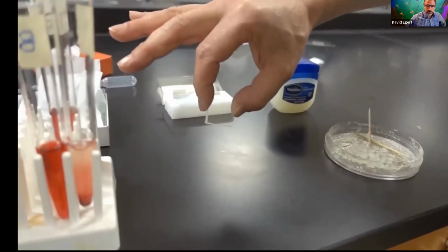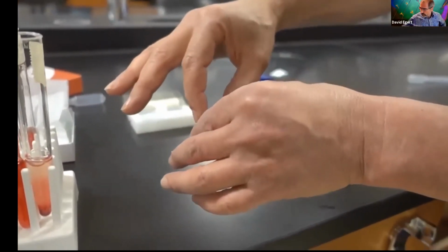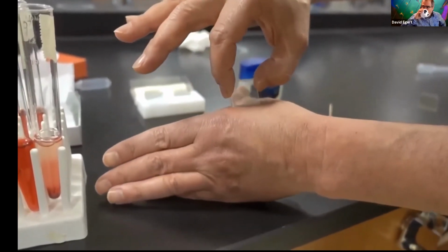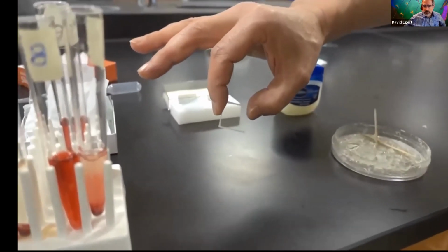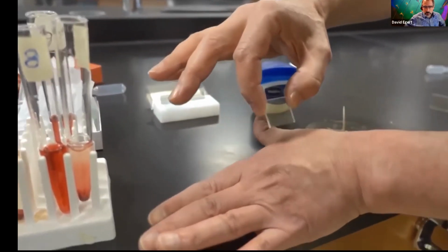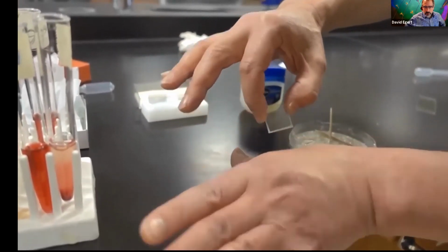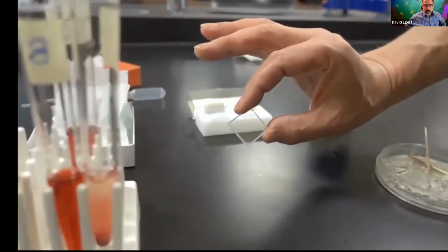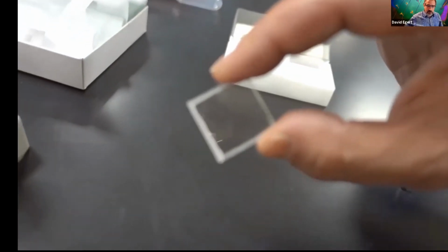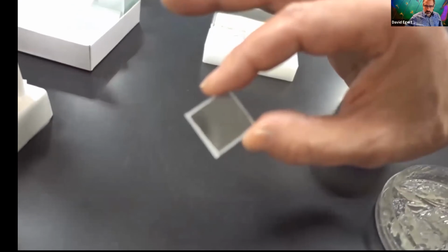Now I have Vaseline on another side. Rotate it again 90 degrees. Vaseline on 3 of the 4 sides. Again, 90 degrees. I'm running out there. That's good. So here you have Vaseline on all 4 sides, kind of underneath, and it's going to make a nice gasket. When I put this down on top of my main slide, it's going to seal around the edges, and I can show you how that works right now.